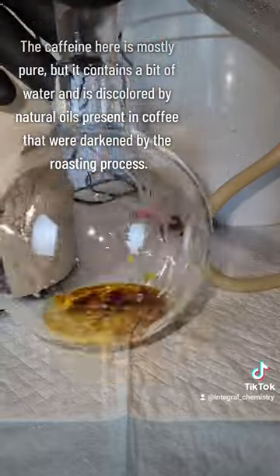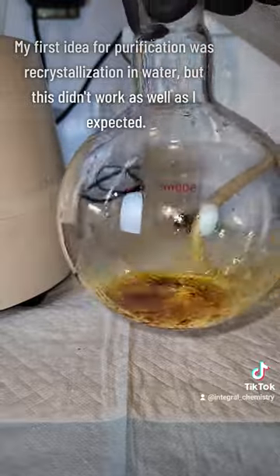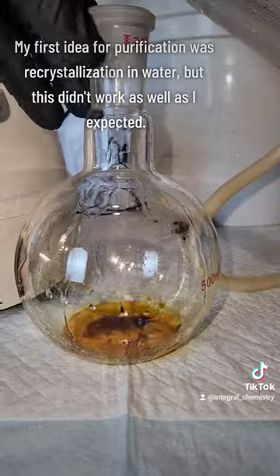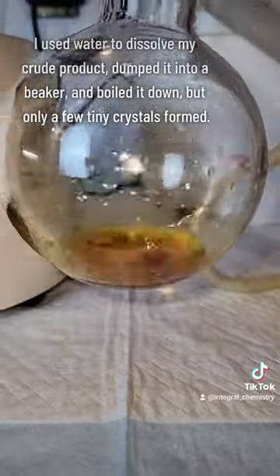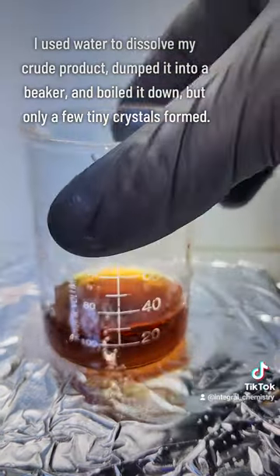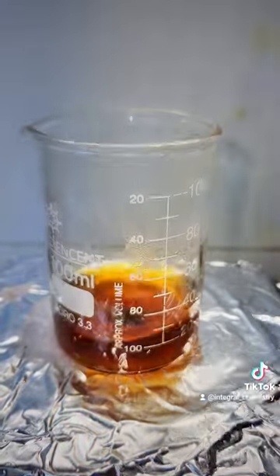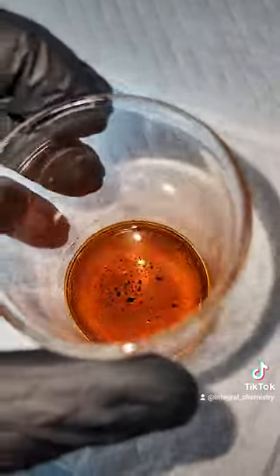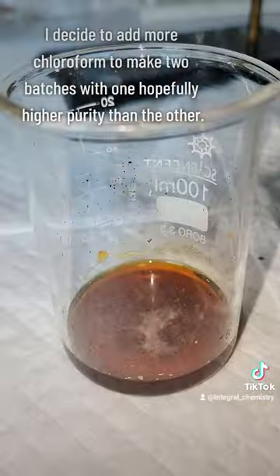Once all the chloroform is evaporated off, I'm left with this crude caffeine that contains some water and a good amount of discoloration. Typically in lab to purify an organic product, we use a technique called recrystallization, which is typically done in water. I tried it here by dissolving my product in excess water, boiling some of the excess off, and then putting it in the freezer to help crystals form. However, only really small crystals formed, which is weird, because this amount of caffeine should not be able to dissolve in this volume of water.